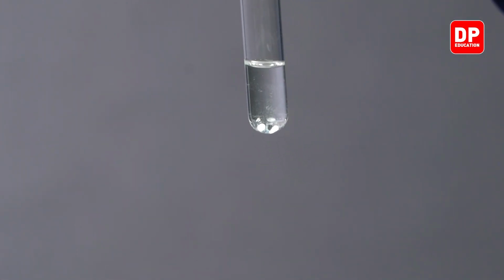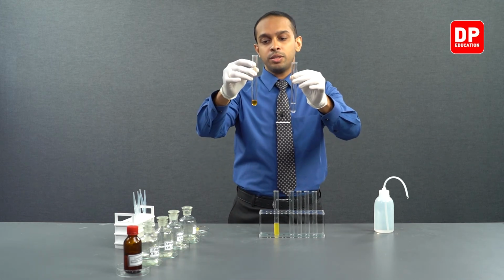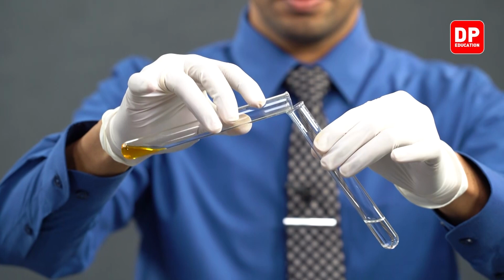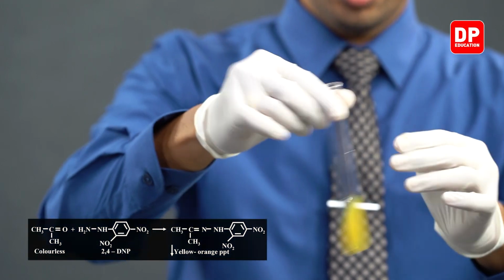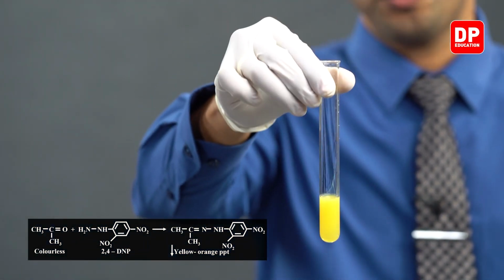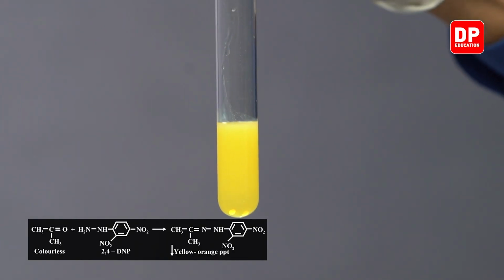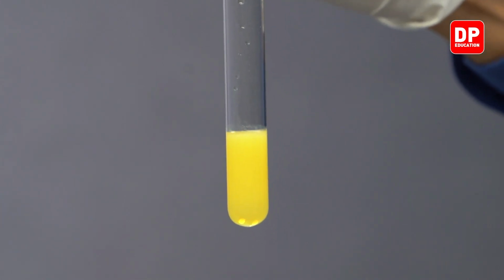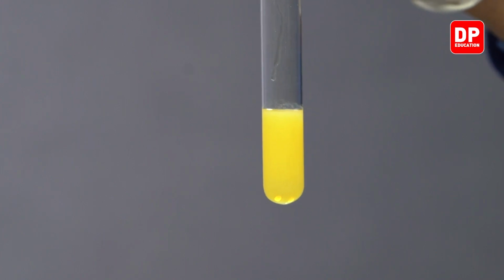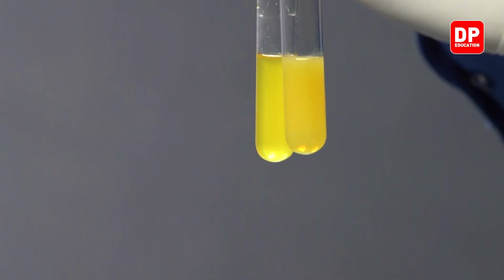Now we have our mixture with acetone and water. To this, we will add our 2,4-DNP solution. You can see, upon addition of 2,4-DNP, a yellow-orange color precipitate formed. Different types of aldehydes and ketones form slightly differently shaded precipitates here. So you can see these two precipitates are not the same color.